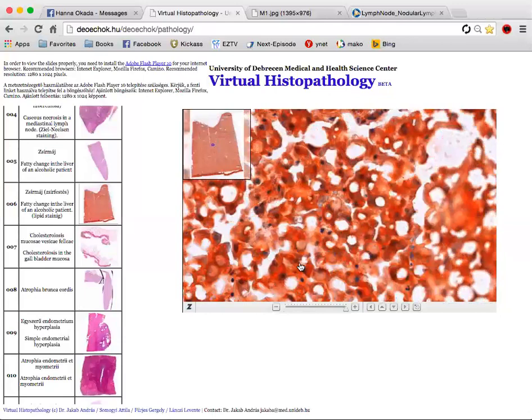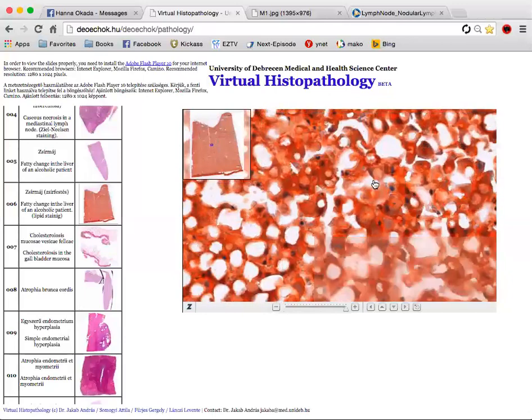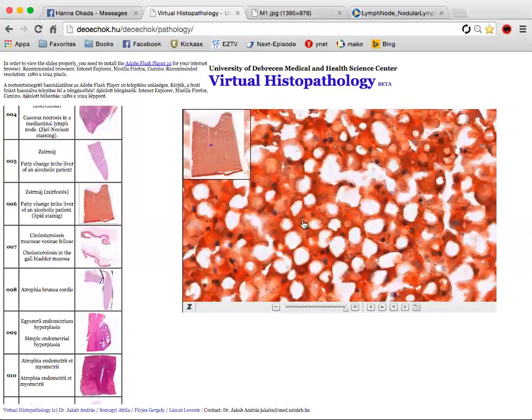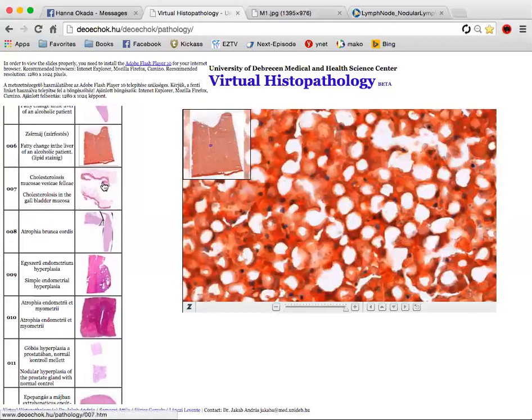So lipids should be stained. Yeah, exactly. If it was a good preparation, and if you get this, that's what you're going to say. You're going to say that in this slide, you can see it because the lipids were washed out, but if they weren't, then they would have looked stained. Okay. So that's all. Okay.